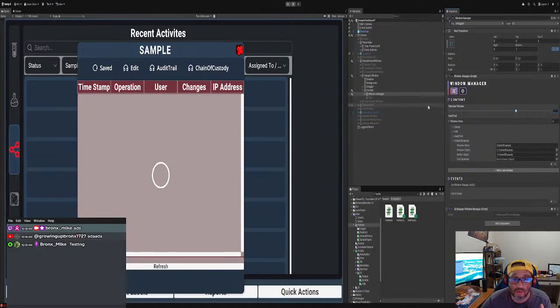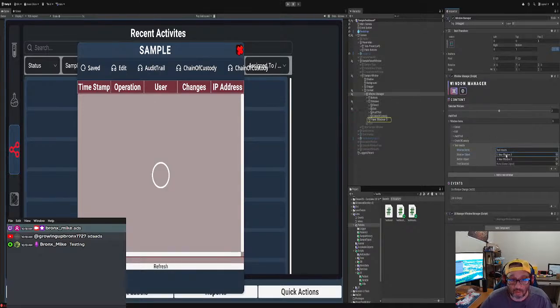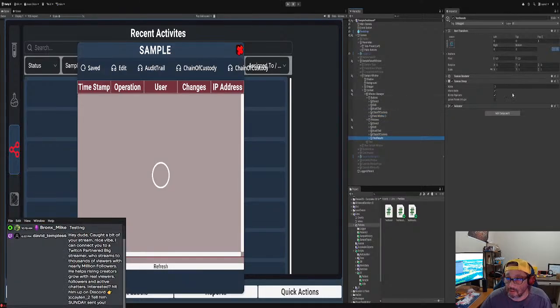So we could do that with our plugin, right? So we're just gonna say add new window. So the window was added, and then we could just say test results here, correct? And then we have our window. We could just make sure we test results, right? And then when we go back here, the buttons too.